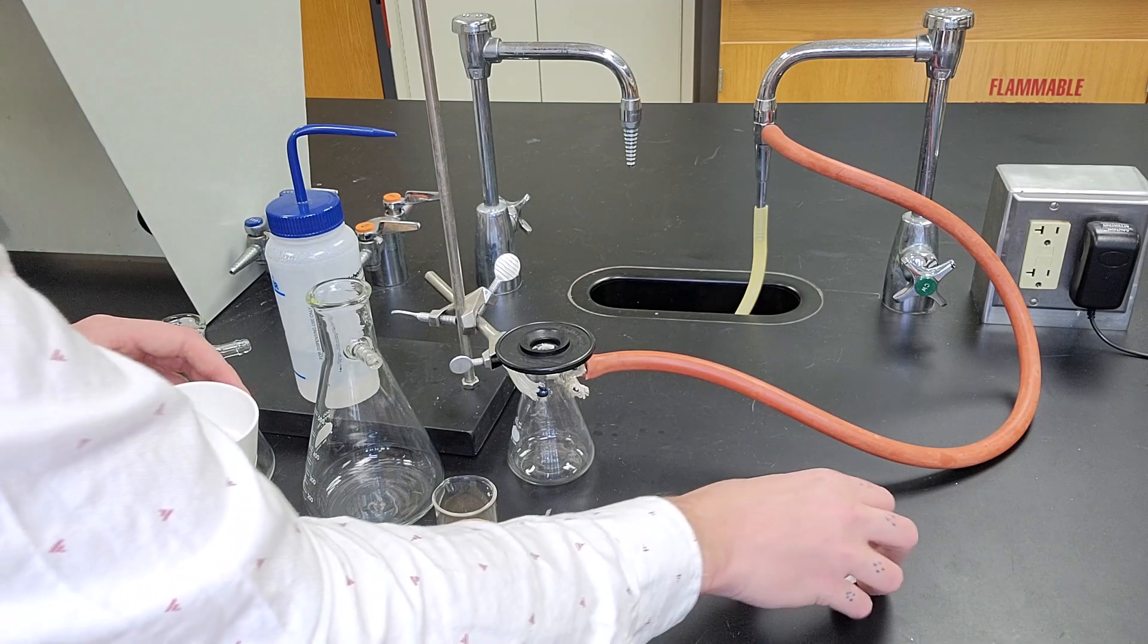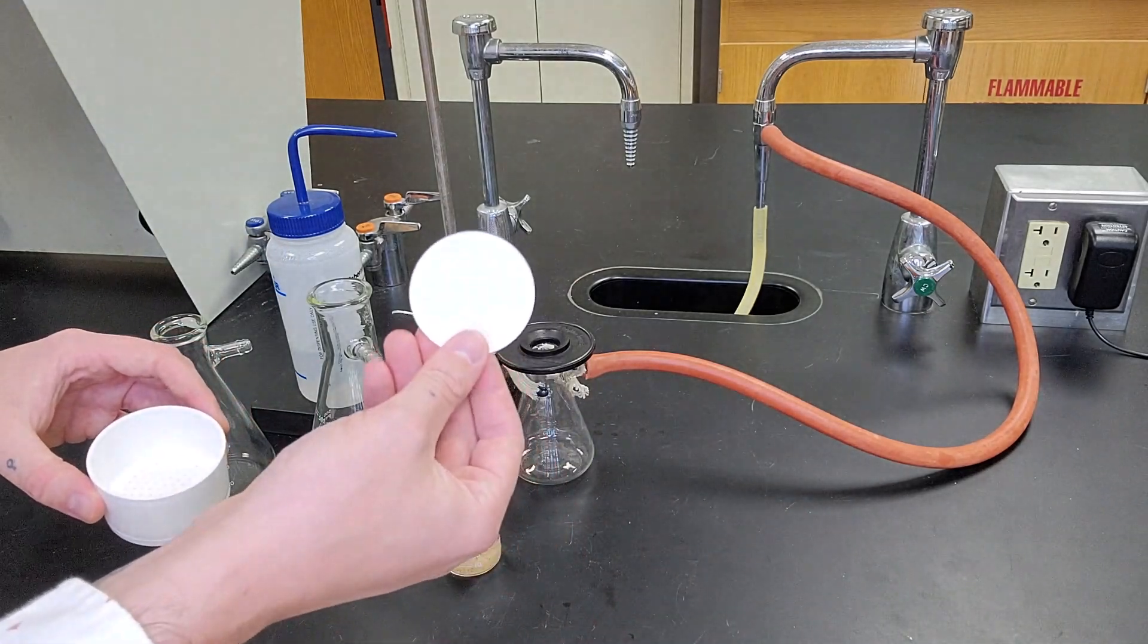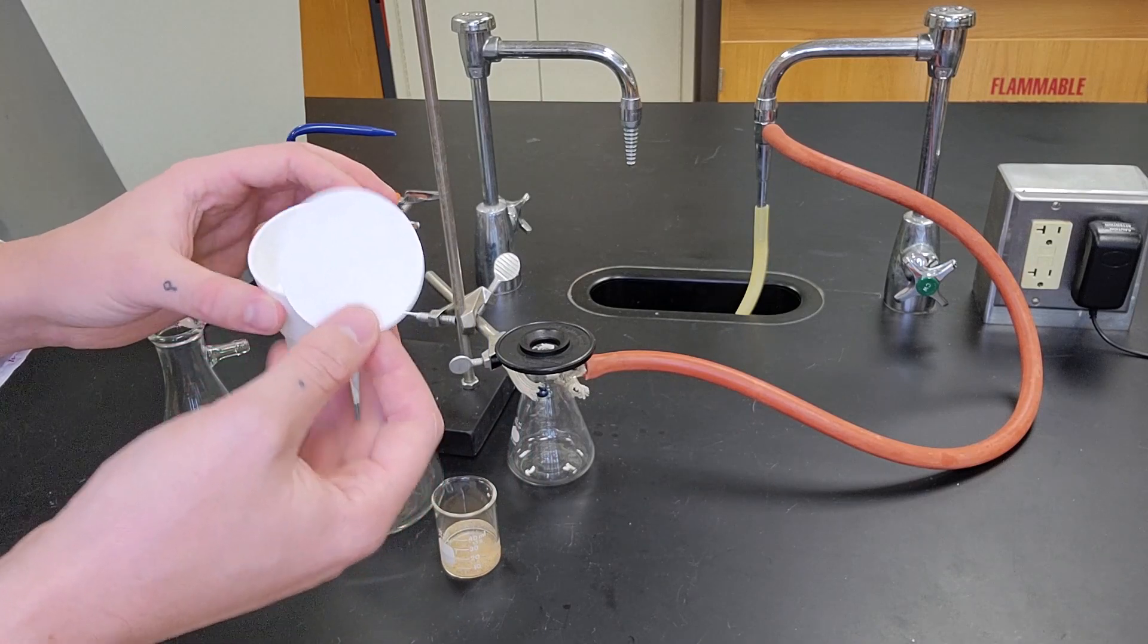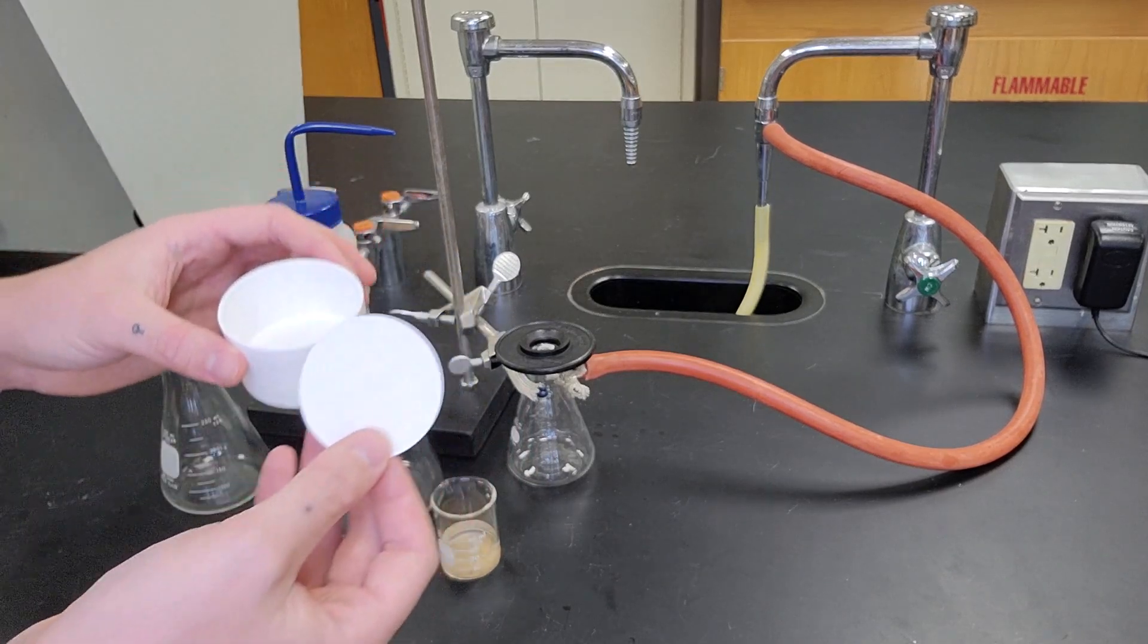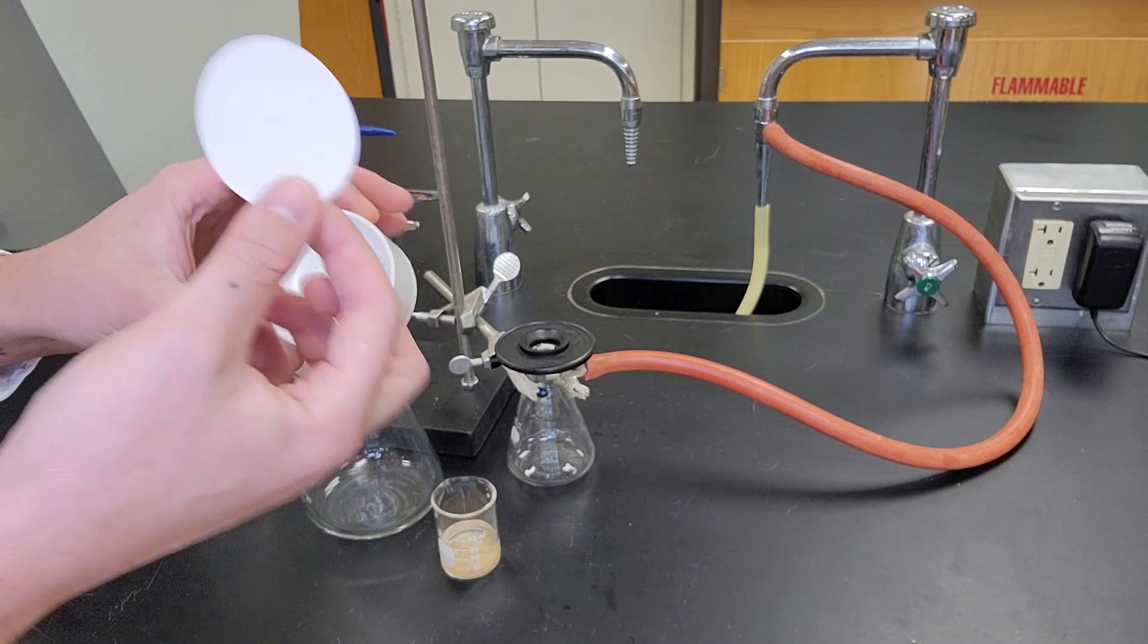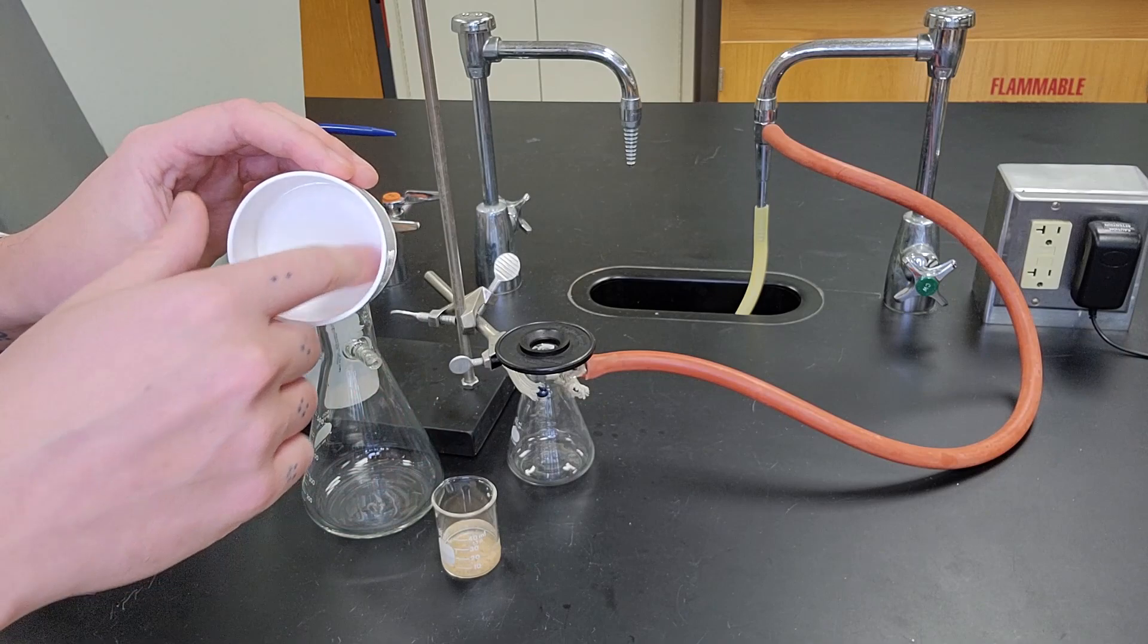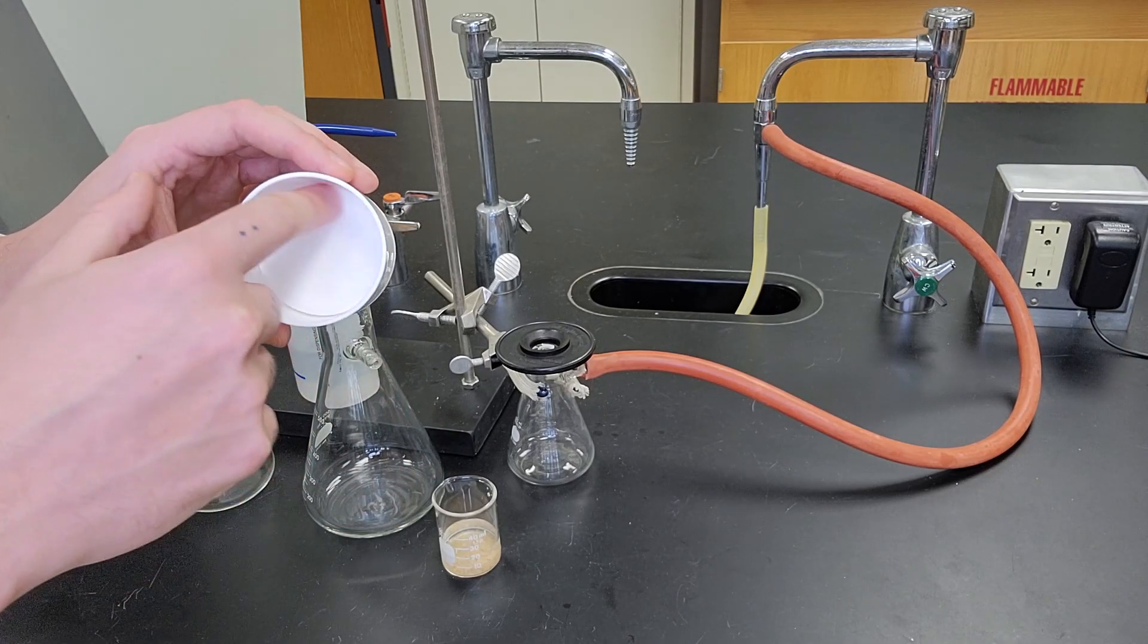Now the filter paper size is dependent on the size of the Buchner funnel. There are various sizes of Buchner funnels depending on how much solid you're trying to filter. You just want to make sure the filter paper is the correct size for your Buchner funnel so that it covers the entirety of the bottom.